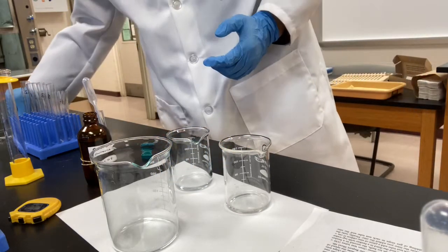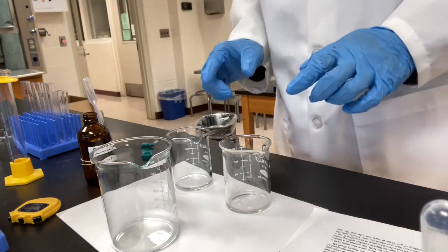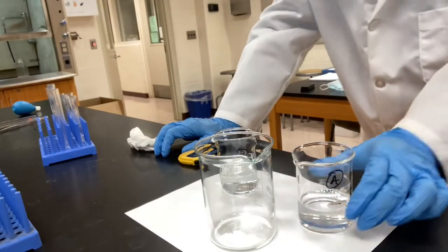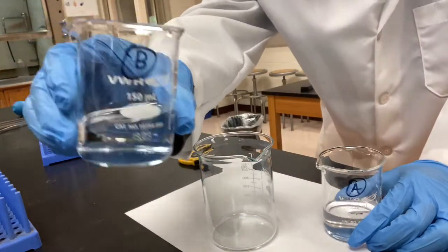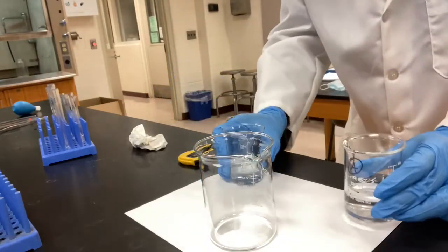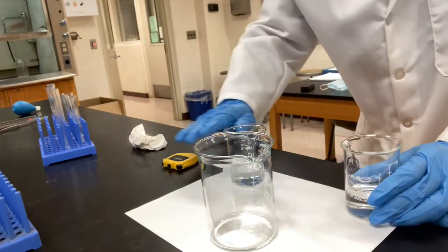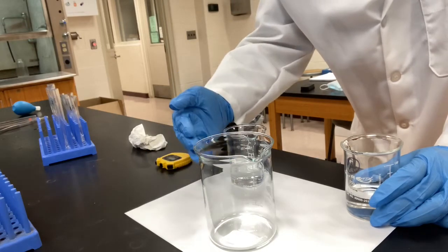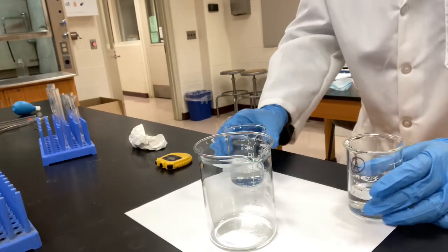Now I'm going to add other components to beakers A and B. Now solution A and solution B are ready. I'm going to pour them into a 3rd beaker. I'm going to start my stopwatch, and I put a white paper at the bottom so that I can see the blue color come up clearly.